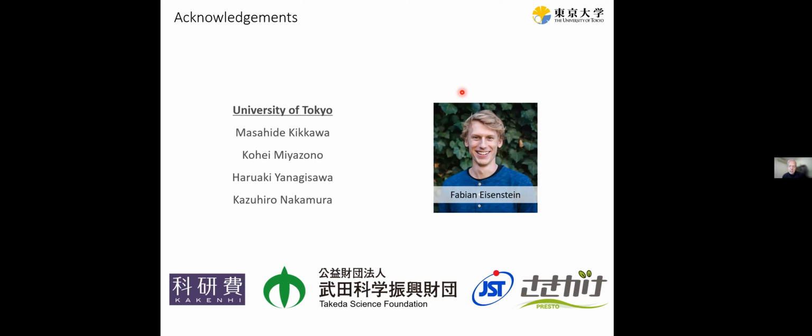The other question was about multiple shots. Yeah, multiple images. We are collecting nowadays with 2 images per hole, just because of the magnification and the shape of the K2. It's a bit rectangular, so you cannot fit 4 easily unless you go to higher mag. There you can do 4 in principle. With the gold grids, in terms of beam-induced motion, there is no detrimental effect. There is a little bit; I still see it perpendicular to the edge of the hole. If you are close to the edge, you should always touch a bit of the film with the beam. That's important to discharge the ice. But it doesn't hurt, I think. So yeah, multiple shots per hole are definitely okay.